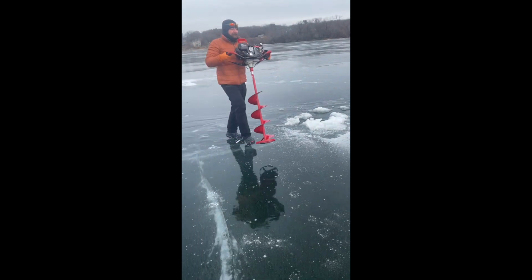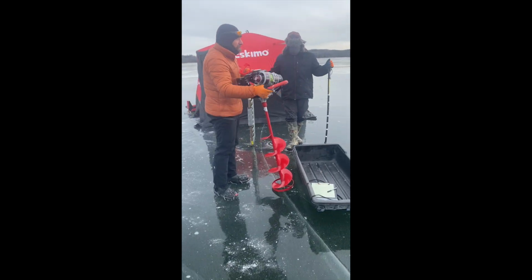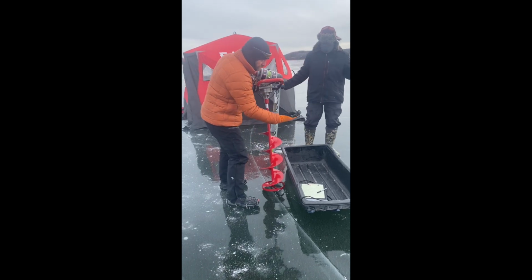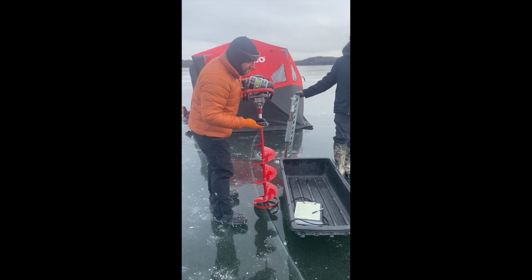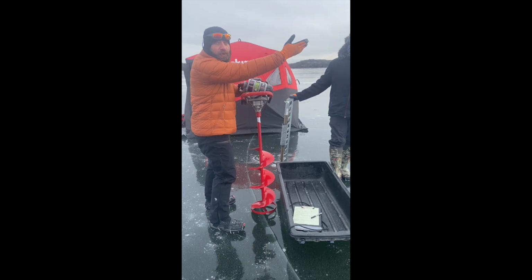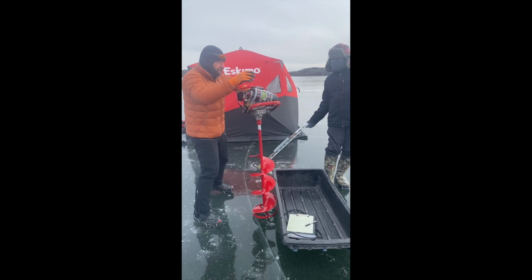The way, again, like I said, we'll do is we'll use this sled as sort of a cover, and we're going to keep the ice, if there is snow, undisturbed on the south side of the hole, because that's the direction the sun is shining here.